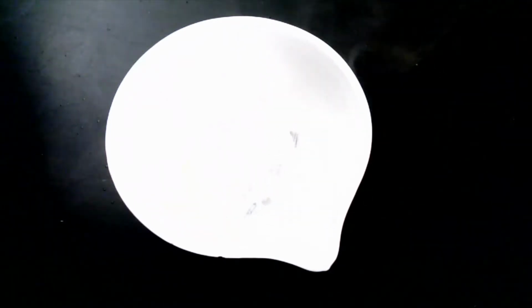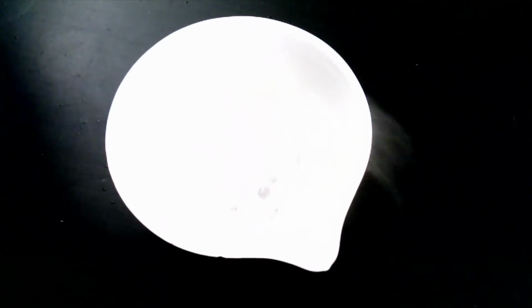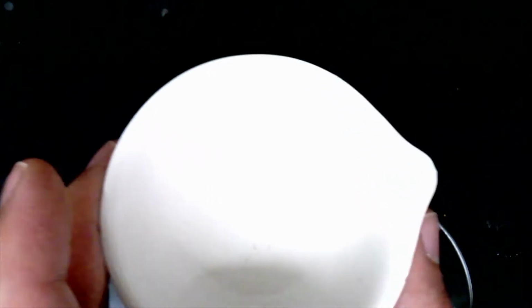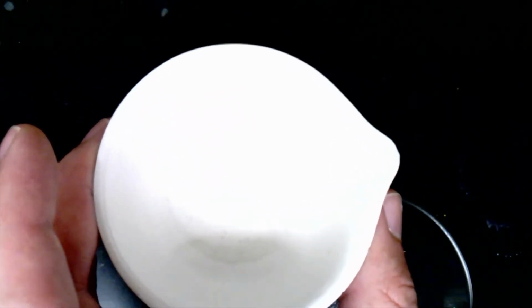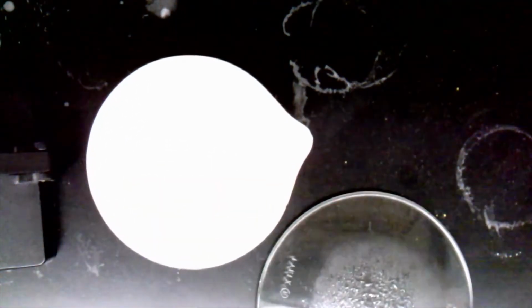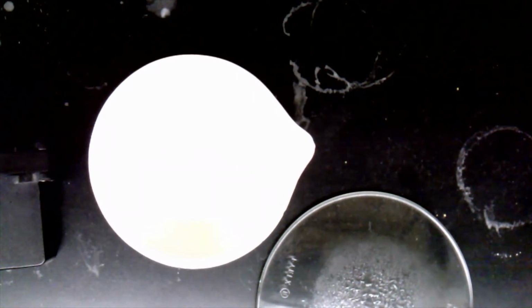I'm going to go ahead and transfer this over to the hood. I'll show you what it looks like once it's done reacting. It's kind of hard to see the contents of this. Let me try to get some shade on it here. But this is really just full of liquid now. Okay, there's no metal left, just some tiny little flecks. It really just looks entirely like a clear solution.